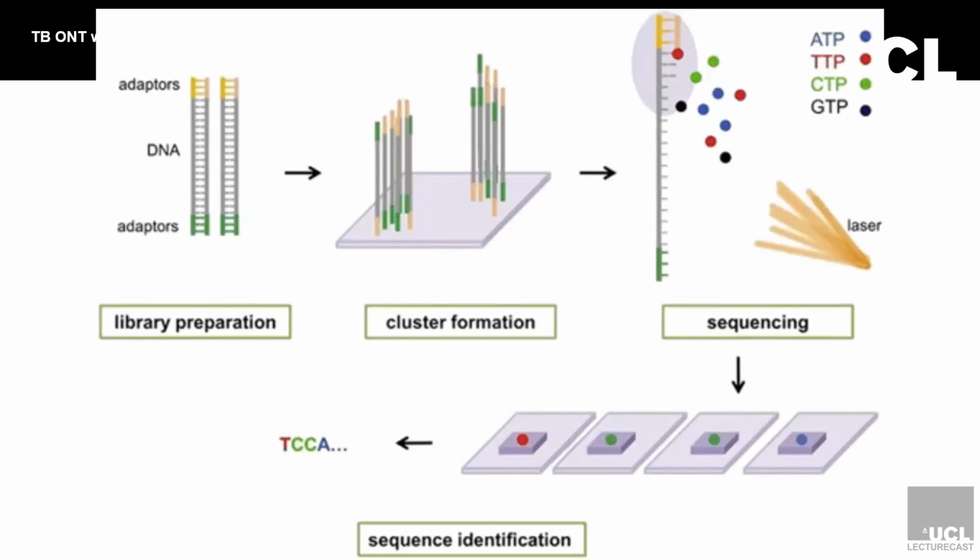So your amplified DNA then attaches to your plates, and then the little fluorescent dideoxynucleotides, which are shown over there, are then attached, and that's how the sequence is read. It will keep on attaching until it reaches the length of the fragment that you wish to amplify, whether it was 150 base pairs long or 300 base pairs long. It will keep attaching those fluorescent nucleotides, which are then read by a laser at each step. And then that's how the sequence goes up.